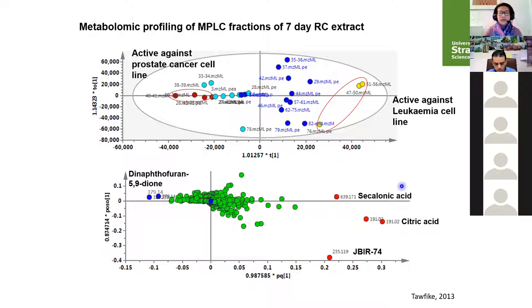The great advantage of that in biotechnology or fermentation work is that it is easier to detect citric acid indirectly to be able to say that we have increased production of secalonic acid. Secalonic acid is a larger molecule and it's more difficult to detect. Usually, for example, you're using IR as a detector probe in biotechnology or fermentation tanks, yeah? And I think it's easier to detect citric acid when calibrating these types of probes.